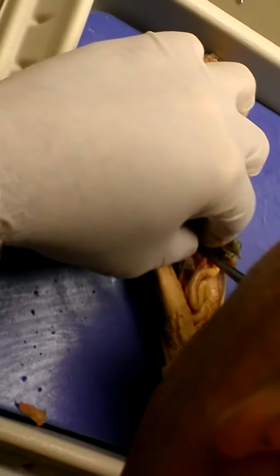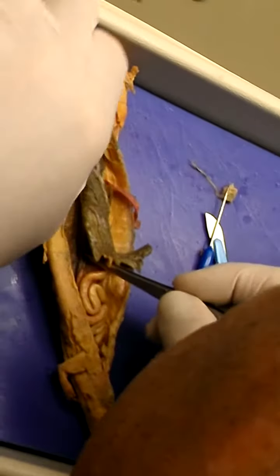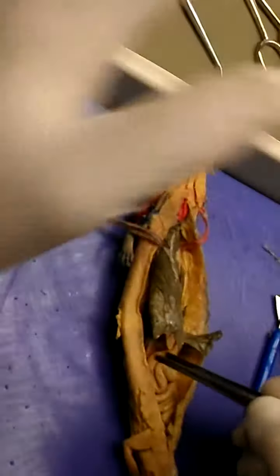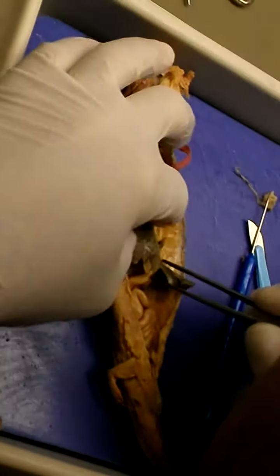Okay. Here's the other lung on this side. Okay. That's the other lung. They're not really big like the lungs over there. They're just simple sacs. Okay. So that's the lung. All right.